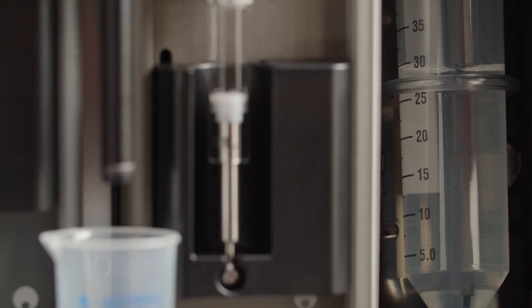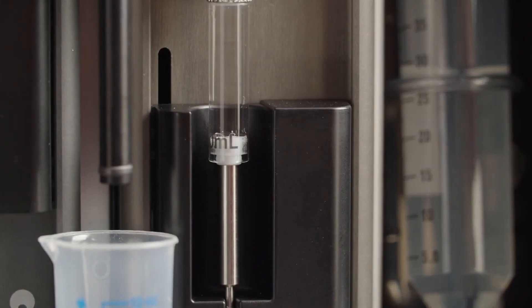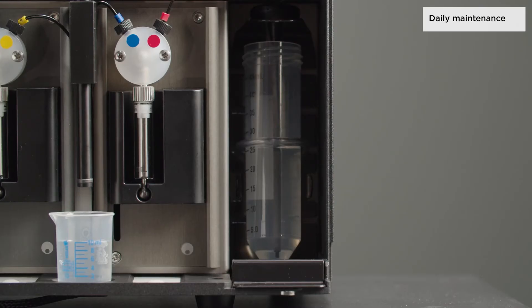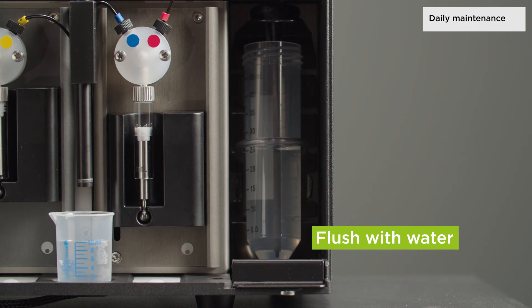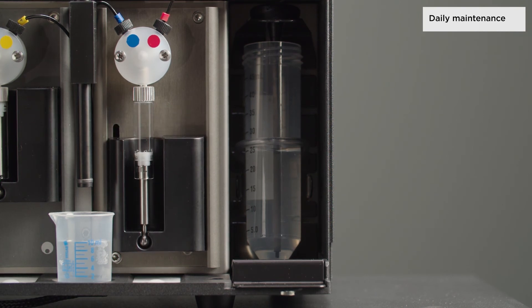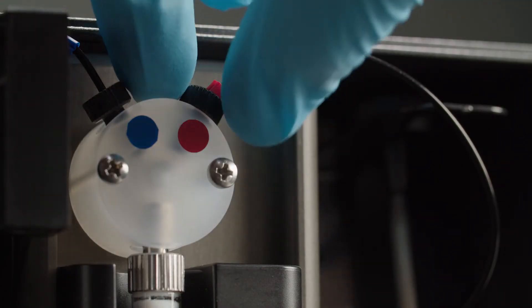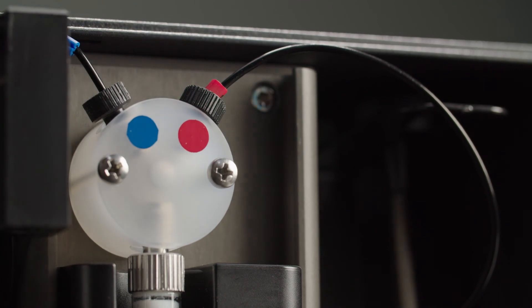Prevent clogging of the syringes and cross contamination by cleaning your injector module regularly. Visually inspect the syringes and tubes for leaks and thoroughly flush the whole system with distilled or deionized water after each use and when the syringe is not in use. Once a month, check the valve connections and tighten them if necessary. Do not allow the syringes to run dry for more than a few cycles.